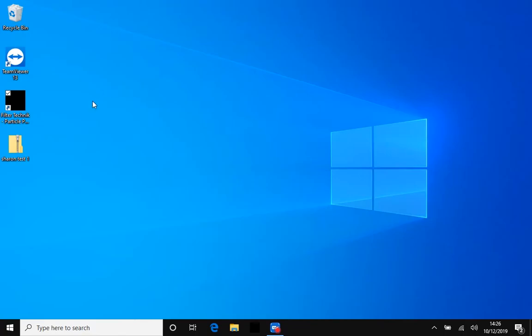Hi there and welcome to the second how-to video guide to our Particle Pal Pro. In this video we're going to be covering the navigation of the software. Please know that you can use either the mouse or the touchscreen for all of these features.